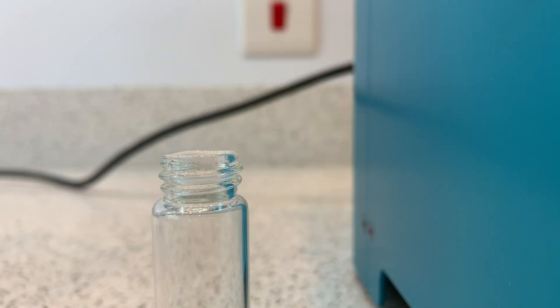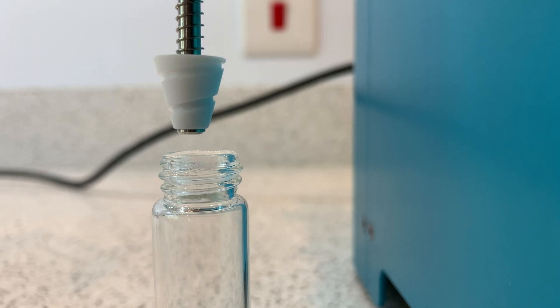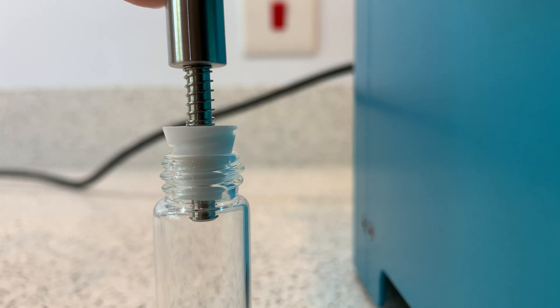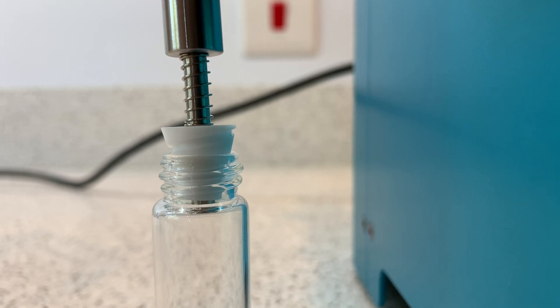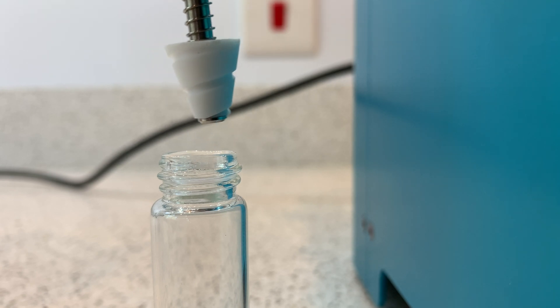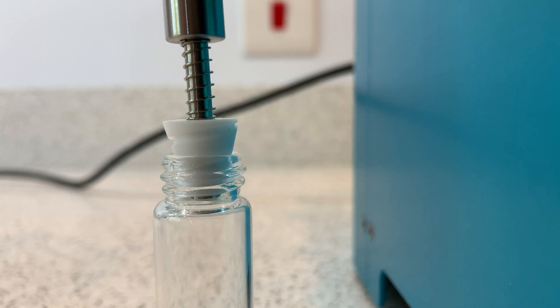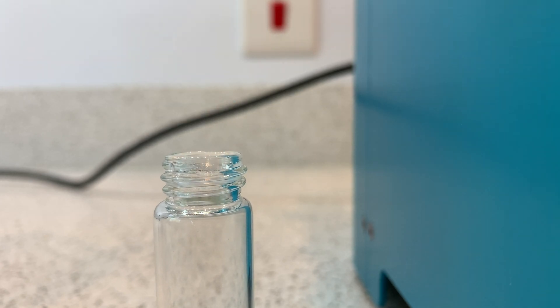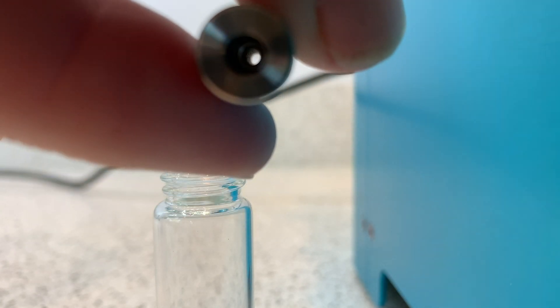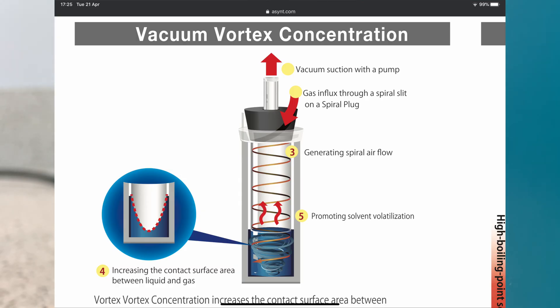Here you can see the top of the tube and what's called a spiral plug. This is the core behind the idea. A spiral plug is a plug with a spiral groove cut on the outside, and down the centre it's hollow.